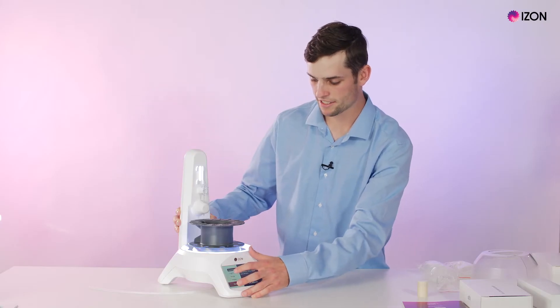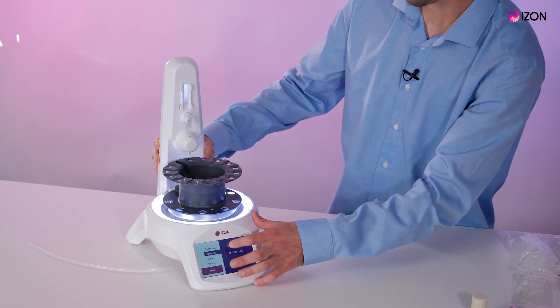We can then customize our lighting — we can either have the lighting on or off just by pushing the button.